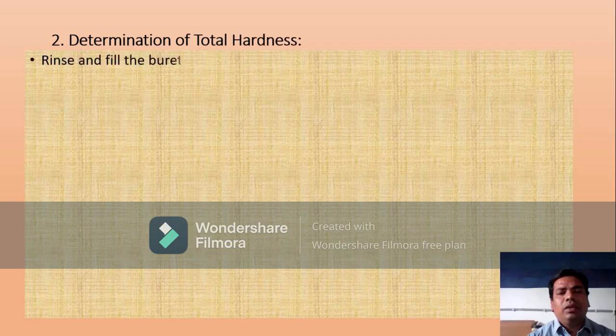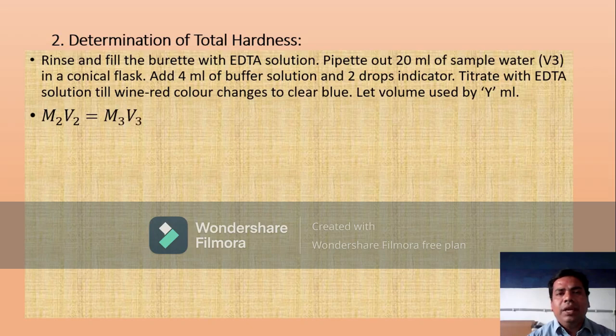Same process, rinse the burette with tap water, distilled water, and with EDTA solution, and fill the EDTA solution into the burette. So here please remember, don't take the standard hard water. So pipette out 20 ml of sample water which is available in lab, or you can bring it from your home. మీరు ఇంటి నుంచి కూడా మీ ఇంటిలో బోర్ వాటర్ ఏదైతే ఉందో దాన్ని తీసుకోవచ్చండి.